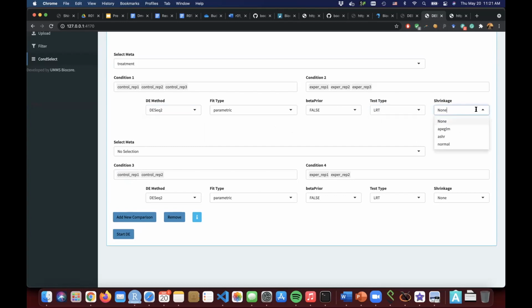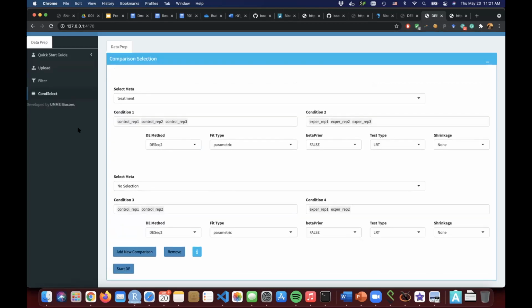If you choose that, it sorts your genes using that statistical value, and that sorting is extremely important for GSEA analysis, because it's going to tell you that in that order of your genes, the top number of genes are enriched in this category, and it gives you a plot. So just make sure you're using shrinkage when you do your GSEA analysis and order your genes.